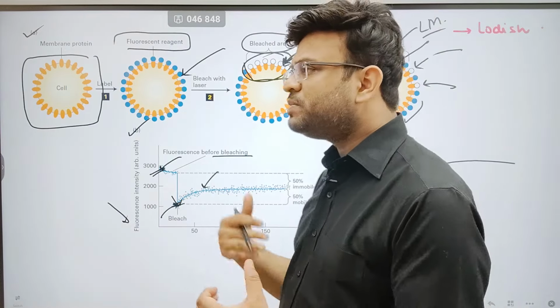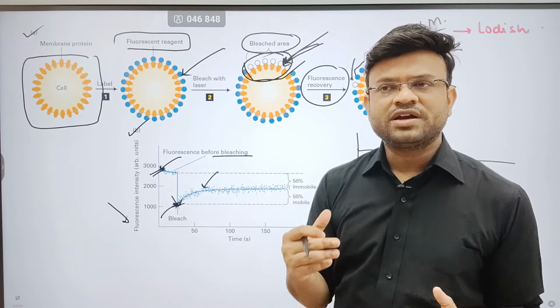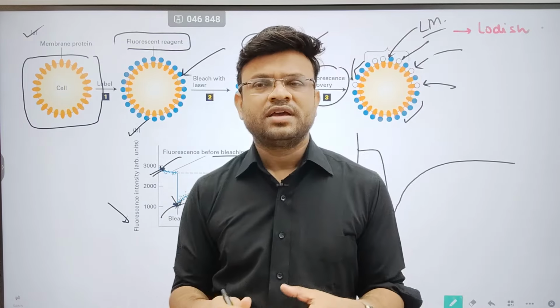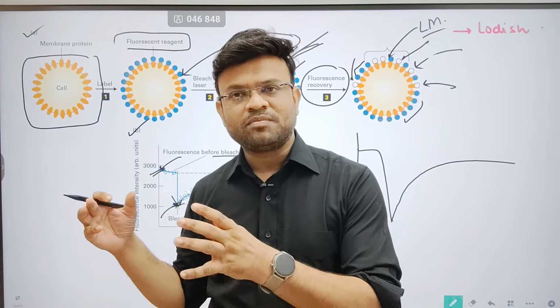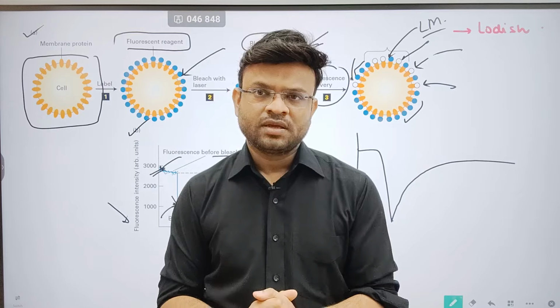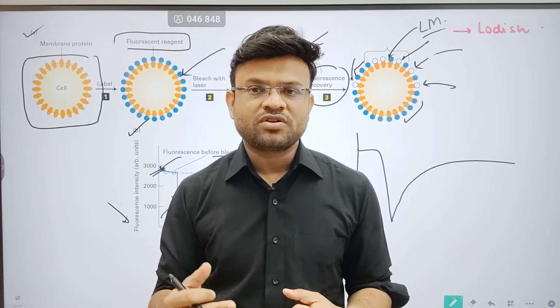Now how much will be recovered? The recovery depends upon the amount of the mobile components present. The more mobile components there are, the faster the recovery will be.